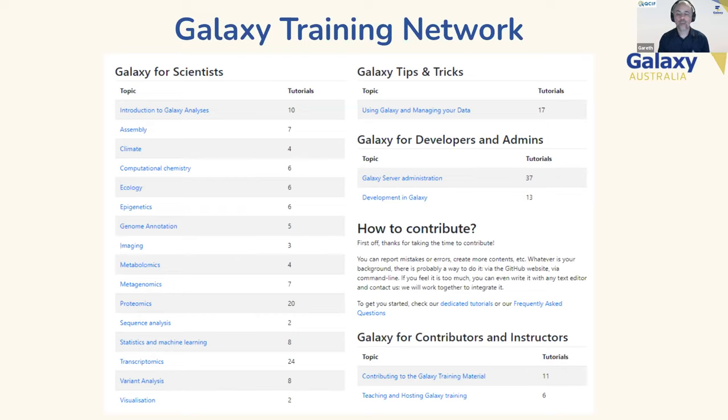So we all appreciate that entering into a new field of bioinformatics or a new field of analysis can be a daunting experience. So the Galaxy Training Network, and again, I can put the link in the Zoom chat in a minute or just Google it, provides nearly 200 tutorials in all these topics to allow you to get a foothold and an understanding of how to process these style of data or this piece of biology on Galaxy. They come fully supported with data, workflows, primary references, time estimates, videos if required. It's really a wonderful resource to self-educate yourself on a piece of biology.